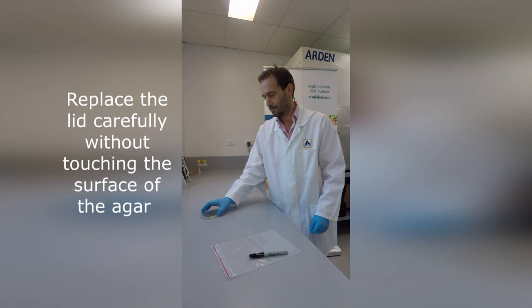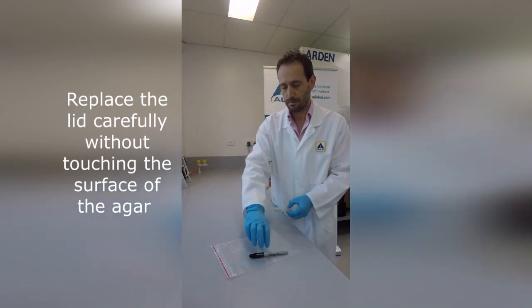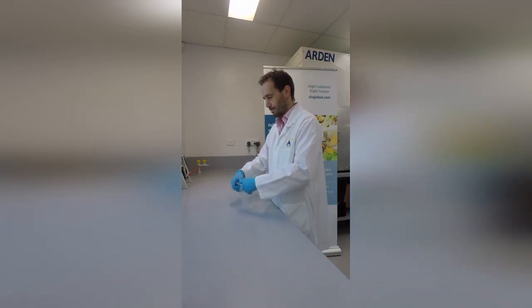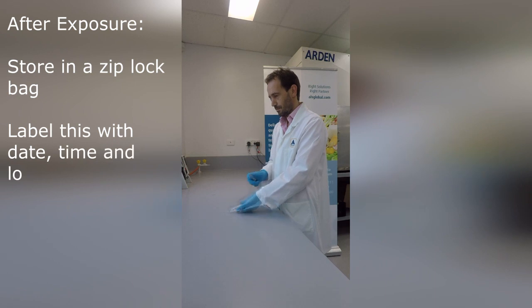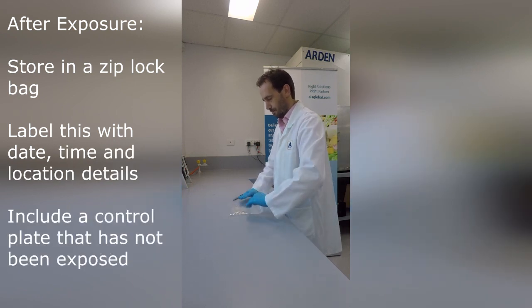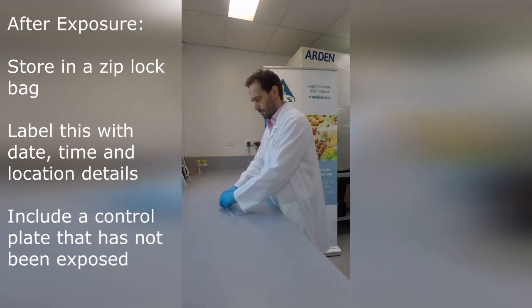Store the plates in a ziplock bag. Label this bag with the details of the samples, including the area, the date and the time. Ensure that a control plate is clearly marked and included, and has not been exposed.